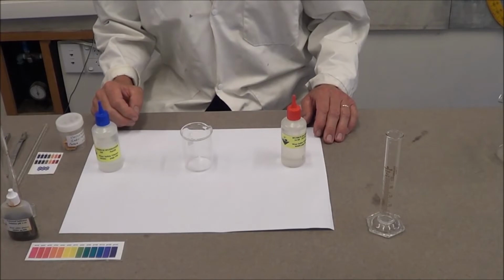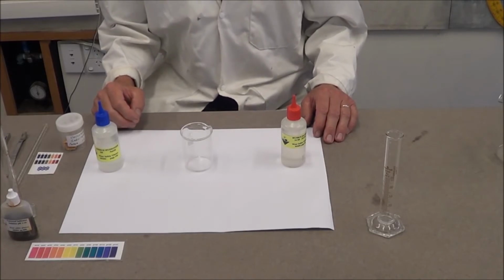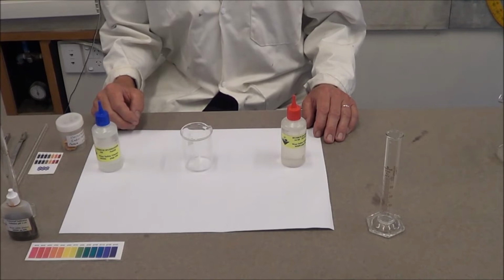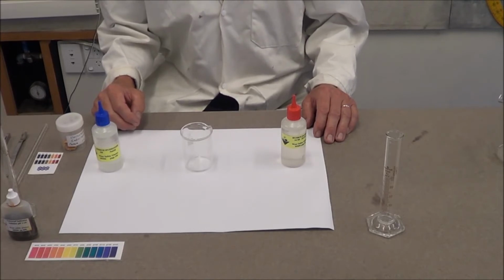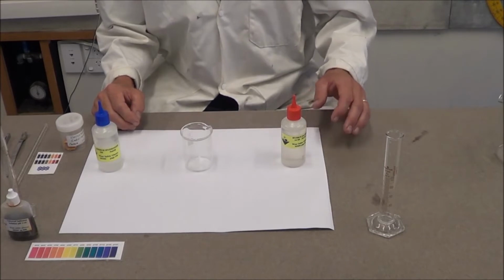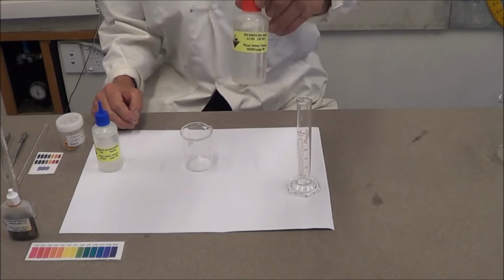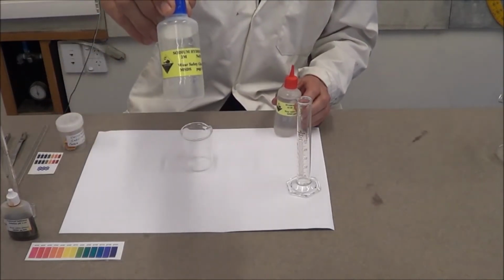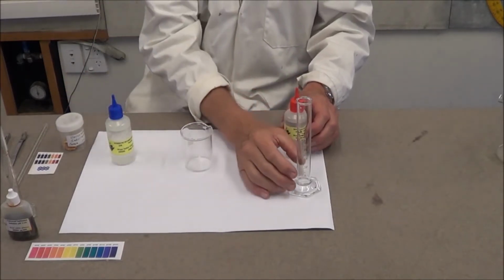In this practical, we're going to carry out a neutralization. You need to check with your teacher that you've got all the safety information and filled out the safety slide on the PowerPoint or written down the safety advice in your practical book. We are going to neutralize 20 ml of hydrochloric acid using sodium hydroxide, both the same strength, 2 moles per litre.